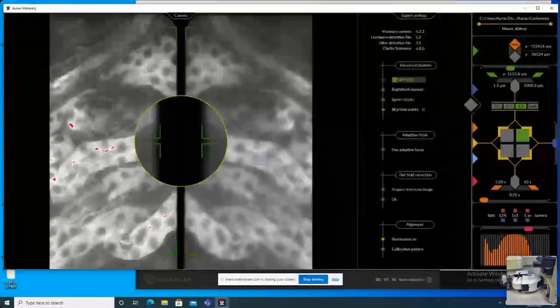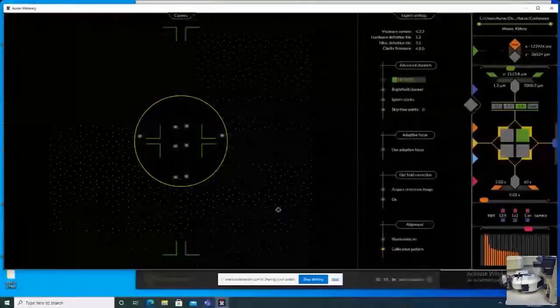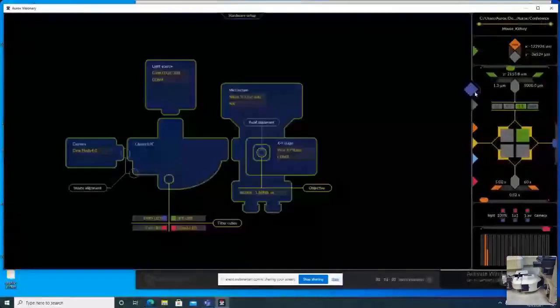To match up each half of the camera, we enter a calibration view. An internal LED inside the system shines light through a mask onto each half of the camera, producing a dot pattern on each side. Using the alignment screws we get an approximate position to line up the patterns. This is done during installation and checked periodically. The software's calibration routine then finds all the dots on one side, all on the other, and matches them up — a complicated registration process, but all done automatically without you having to worry about it.